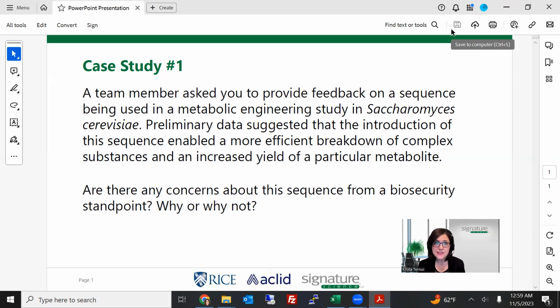I also wanted to mention that this is a real sequence that was provided to me from a bioengineering and biotechnology company. It was something that one of their customers was ordering and using, and they wanted to know what our software could do to analyze the biosecurity concerns that might be present within this particular sequence. It was a challenging sequence, so other bioinformatics software packages were struggling with it, and it was an interesting use case that I thought would be worth mentioning.